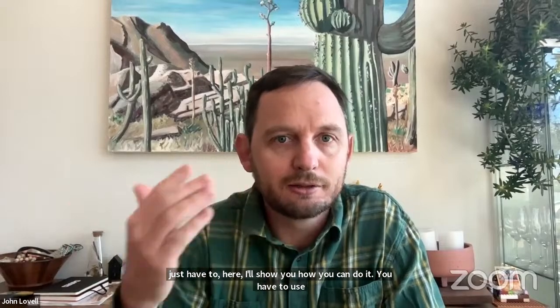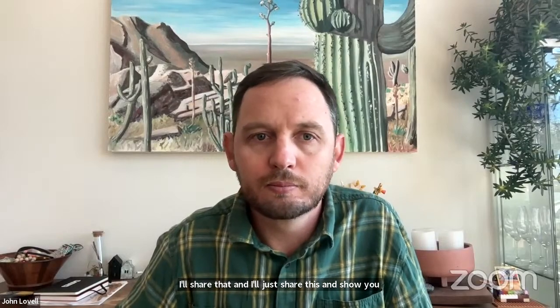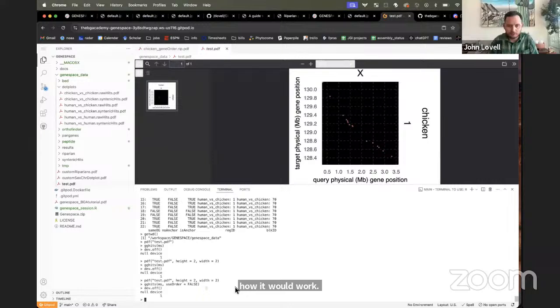So you can still do this. You just have to, here, I'll show you how you can do it. You have to use all of the blast hits, not just the syntenic. And so here, I'll share this and show you how it would work. All right, so if we have something called, we'll just call it all blast, it would be read all blast, I think. And it would be syntenic hits.